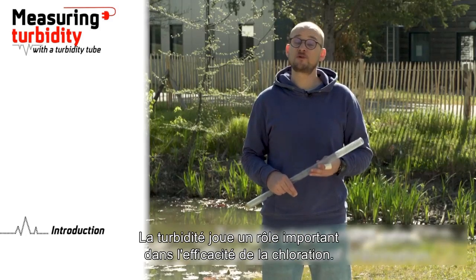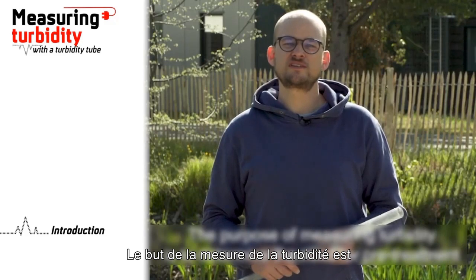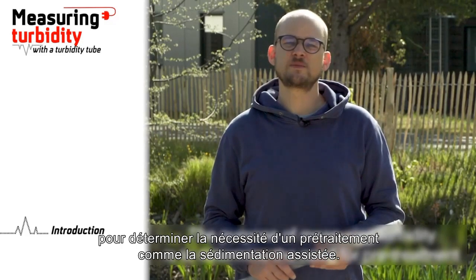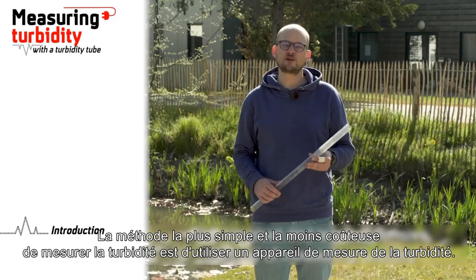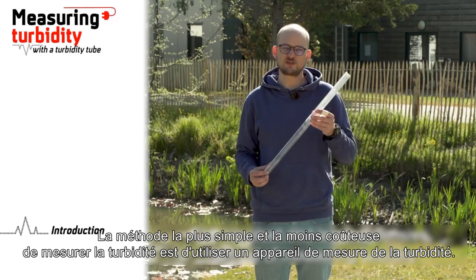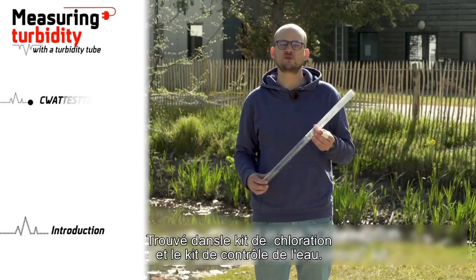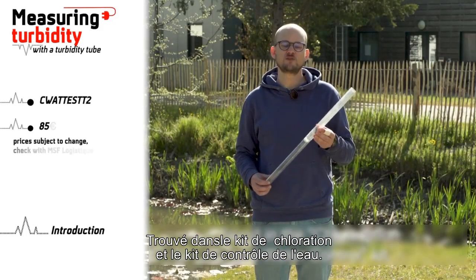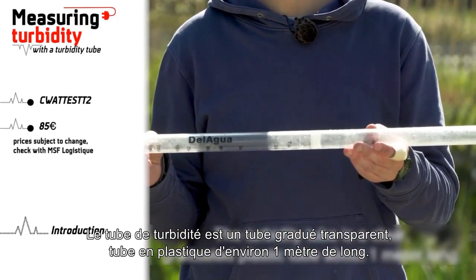Turbidity plays a major role in the effectiveness of chlorination. The purpose of measuring turbidity is to determine the need for pre-treatment, such as assisted sedimentation. The simplest and least expensive method of measuring turbidity is to use a turbidity tube, found in the chlorination and water control kit. The turbidity tube is a clear graduated plastic tube, about 1 meter long.